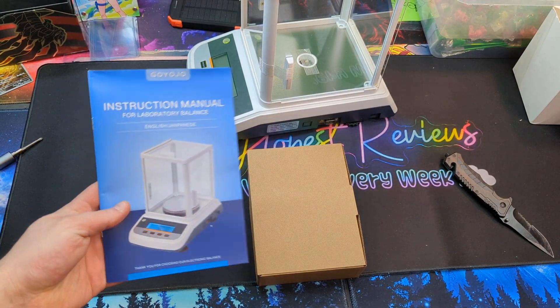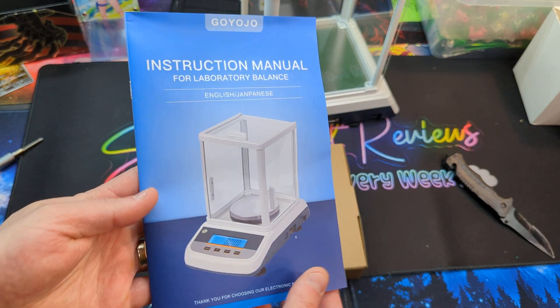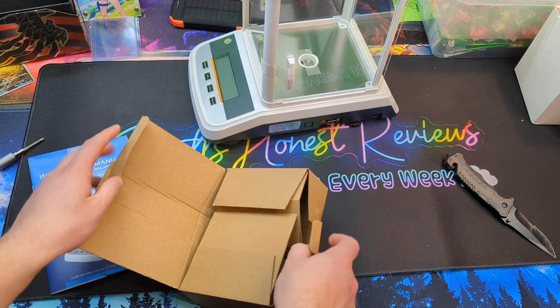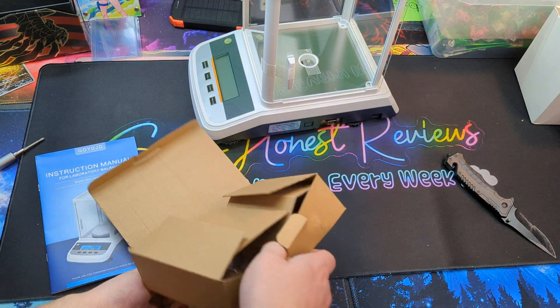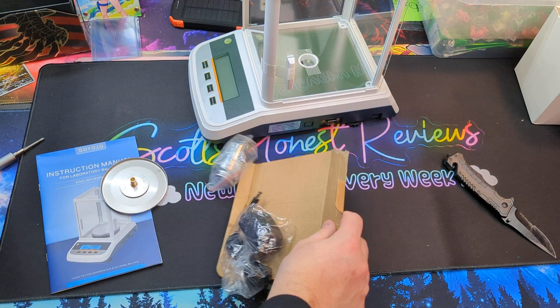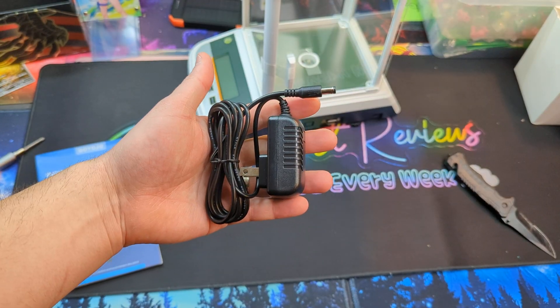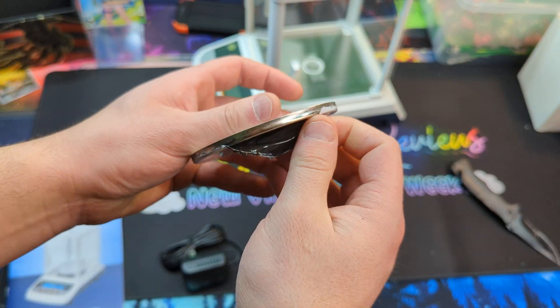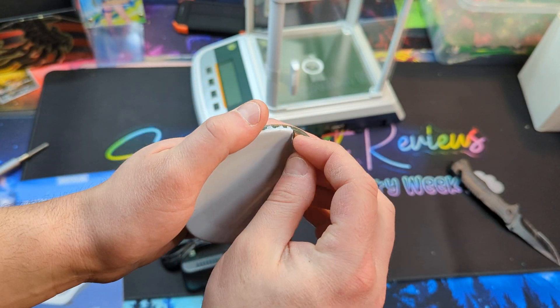Hi friends, today we're showing you the 500g lab scale. Got your manual, let's go ahead and see what kind of accessories they give you. Standard two-prong power cable, and your little plate here. Make sure you peel off this plastic.